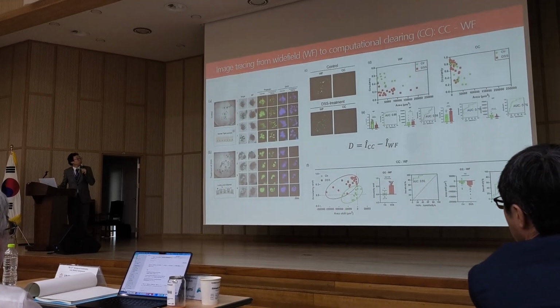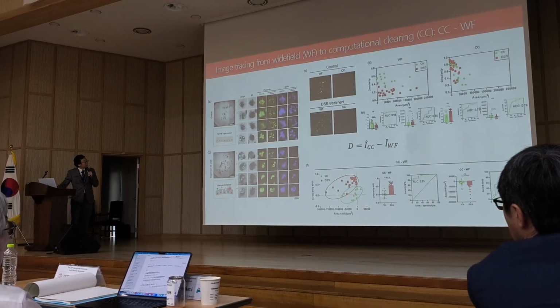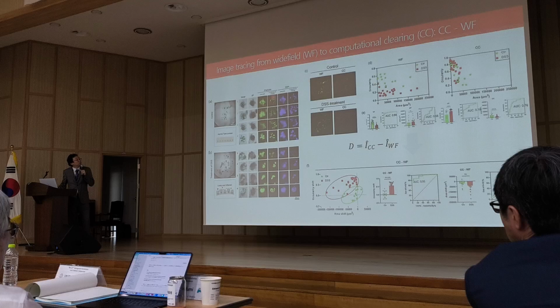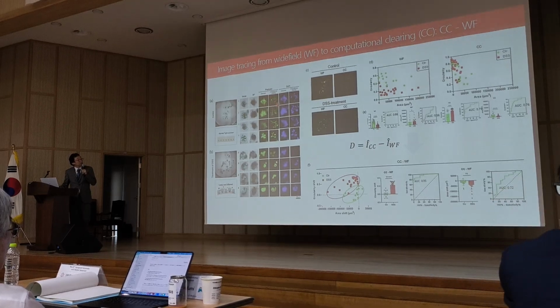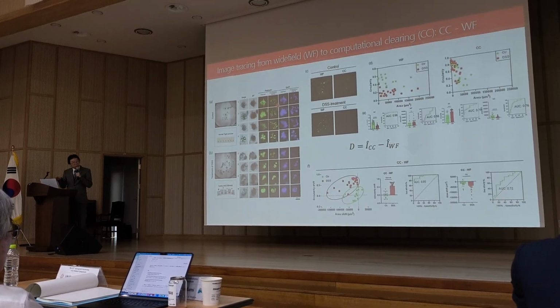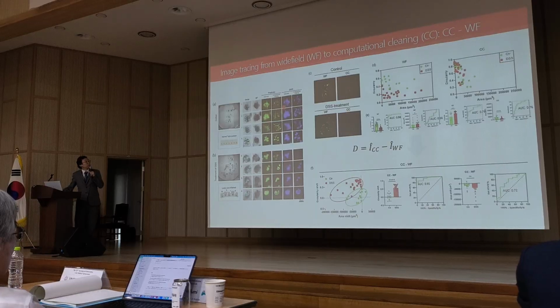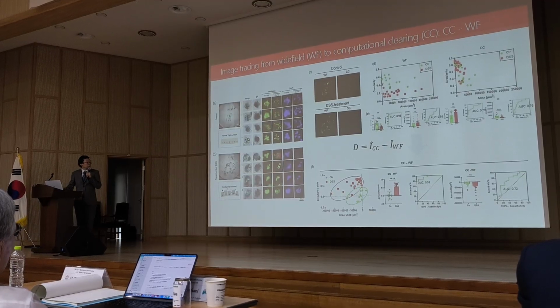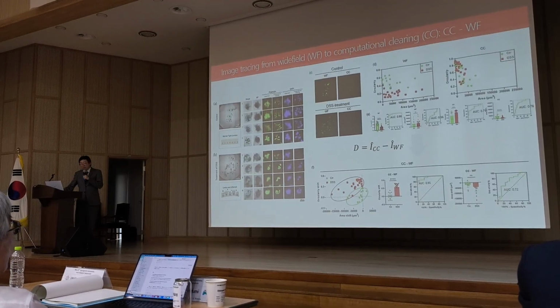We tested 10 to 20 mouse organoids. In the intact one, the signal is very sharply identified at the inner lumen region, while the DSS treated one shows a very broad signal, implying destruction of the epithelial cells.